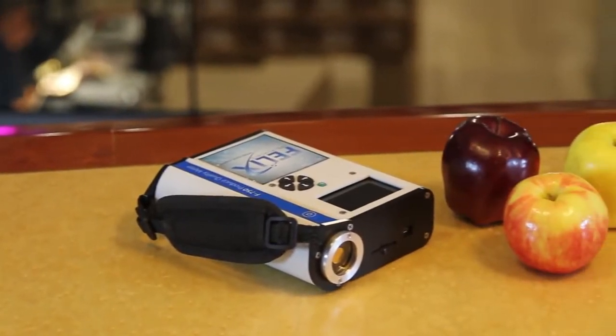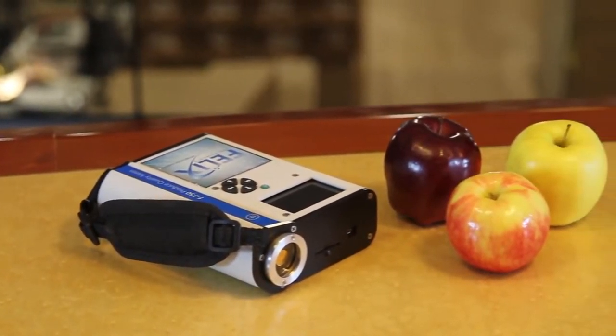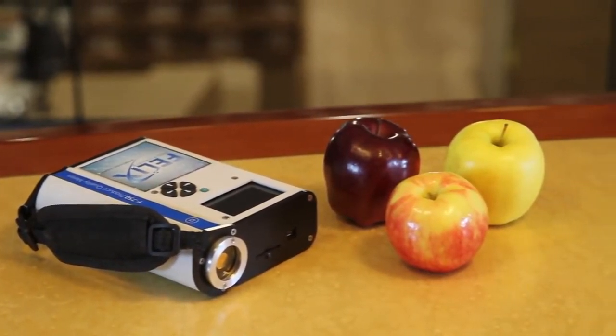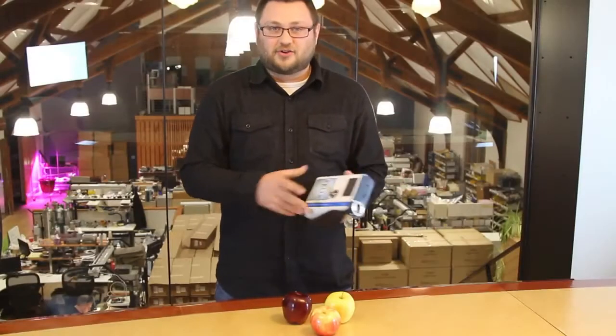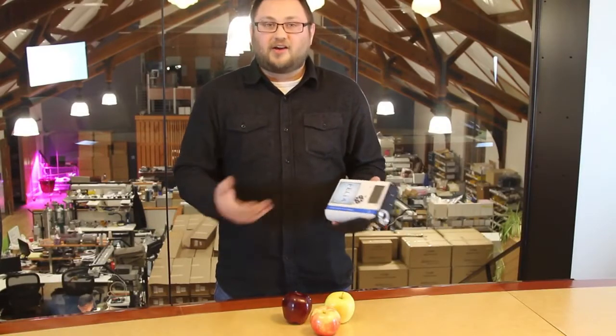This is a sneak peek at something that's still in development, but as you can see, we have a functional prototype that I'd love to go over with you now.